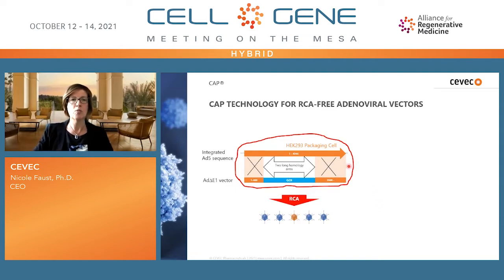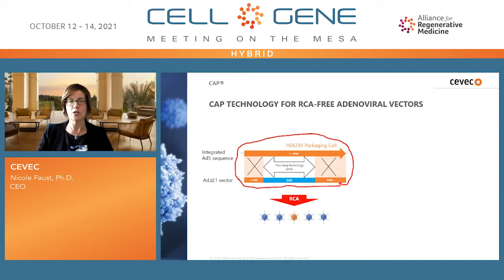This means that in the HEK293 genome, there is a long stretch of adenovirus DNA leading to two homology arms flanking the gene of interest in the E1-deleted adenovirus vector. This can lead to double crossovers and, associated with that, homologous recombination, which then replaces the deleted E1 gene in the vector leading to RCA — replication-competent adenovirus.